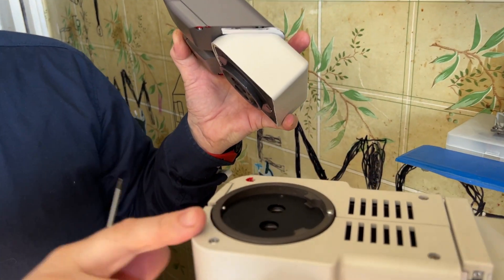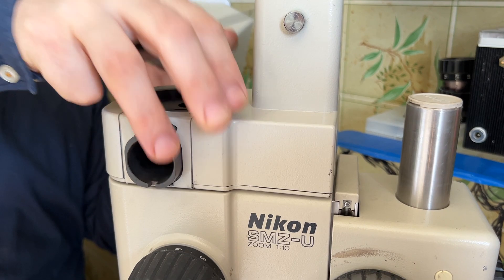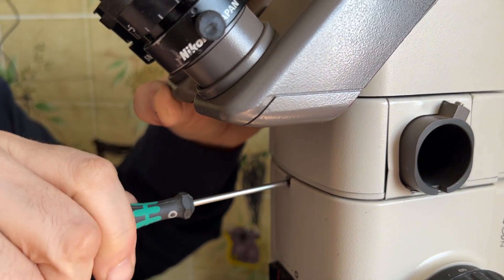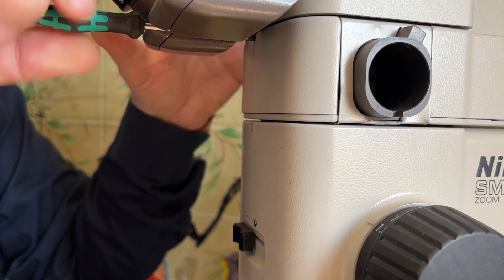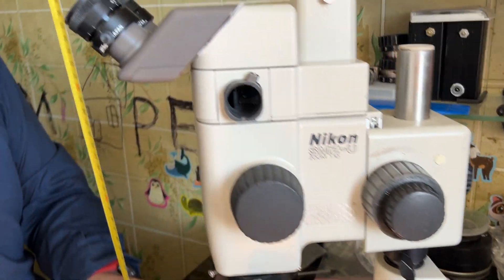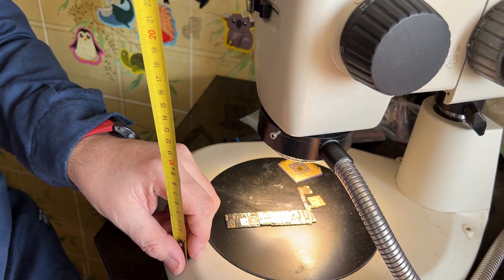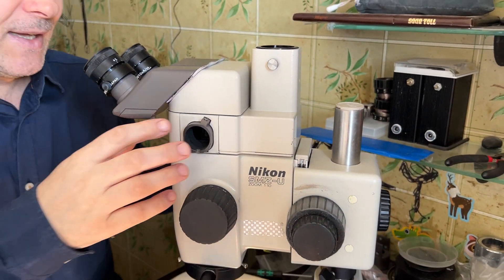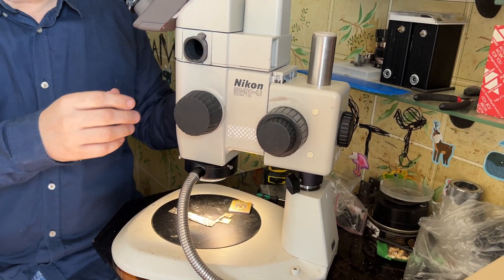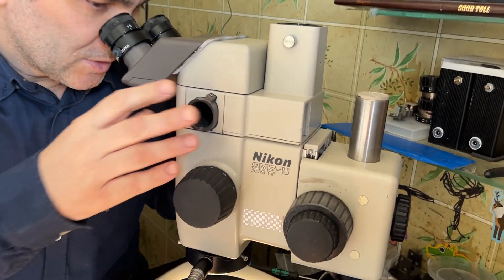Here you can see the zoom module of the Nikon SMZ-U and the binocular head. When we attach the photo splitter, the overall height increases — by four centimeters. Let's check: it is 37 centimeters; it was 33, so four centimeters are added by the photo splitter. As already said, in off mode there is no obstruction on the optical path for both eyepieces.